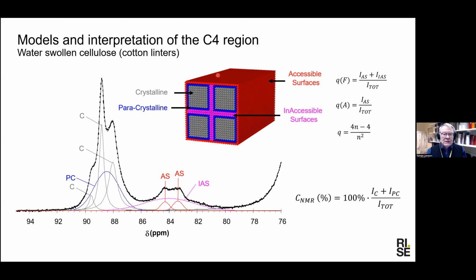And you can see that we have the envelope of the fibril aggregate, which is in contact with surrounding liquid. Then you have the interior surfaces in the fibril, which are also surfaces, but they are mainly contact between fibrils. And then you have the crystalline interior, and you have a transition zone from the surfaces to the interior.